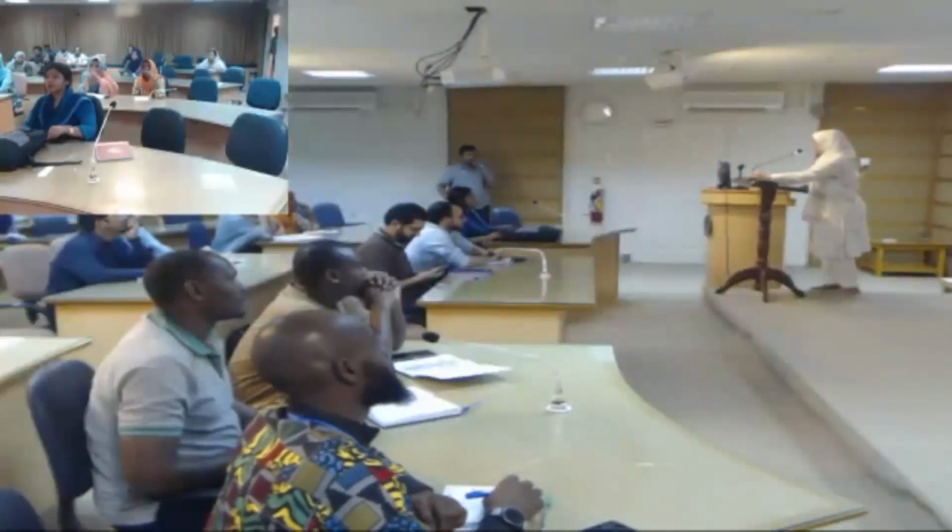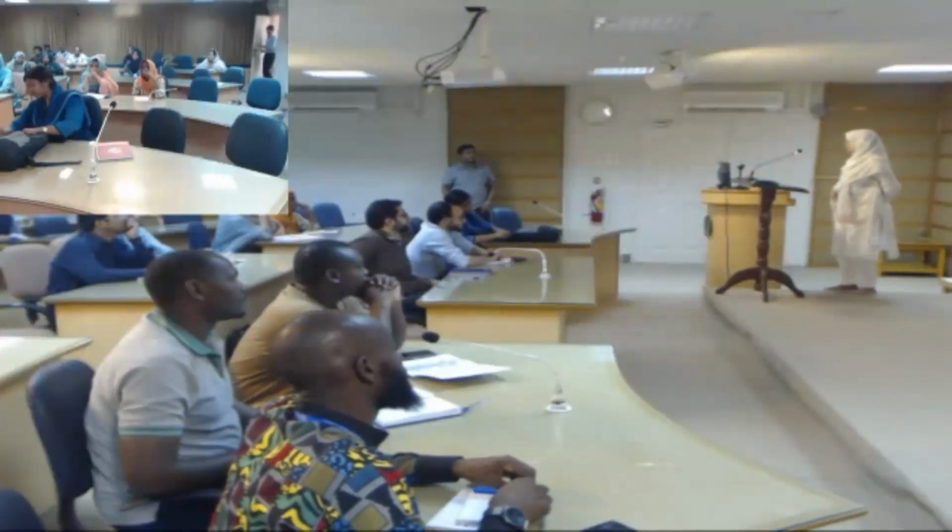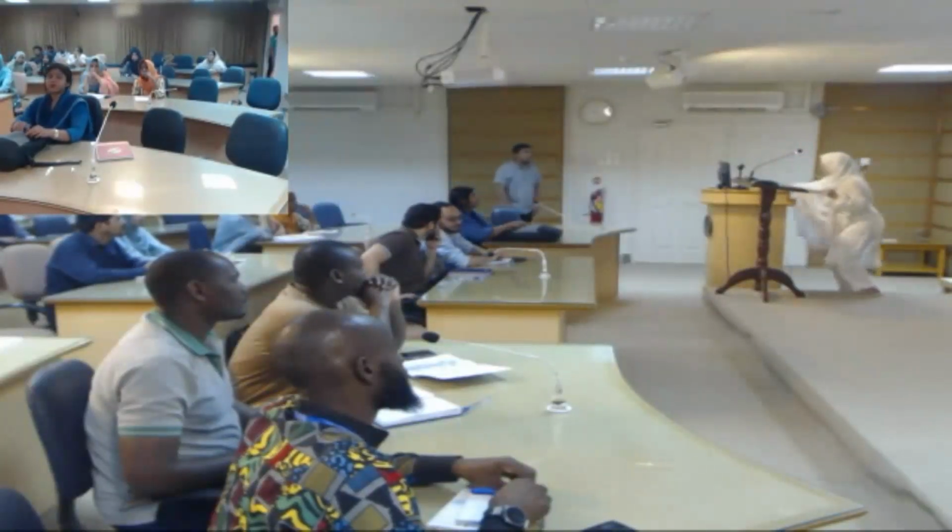Sumera, you got the probe? Yes, it is on the way, sir. Dr. Athiya is bringing the probe, and we will be able to show it in 15 to 20 minutes, sir. But I have, sir, the NMR sample tube and the spinner and a depth gauge.